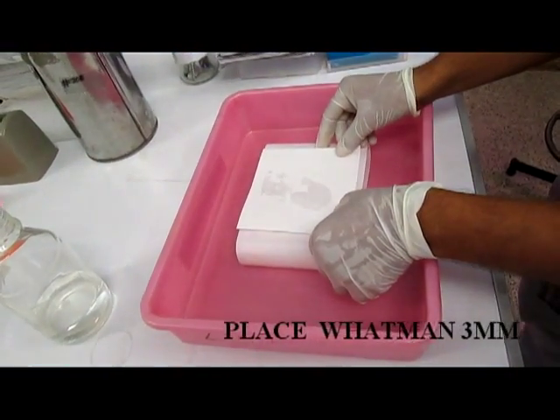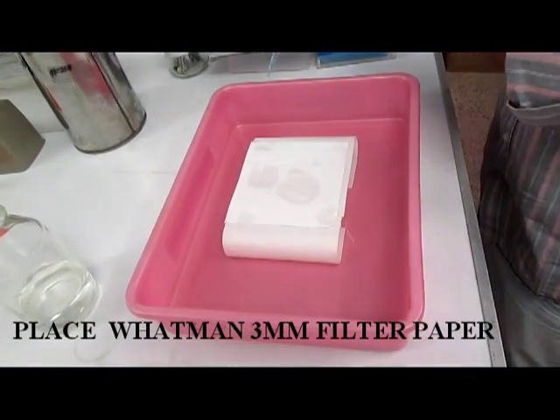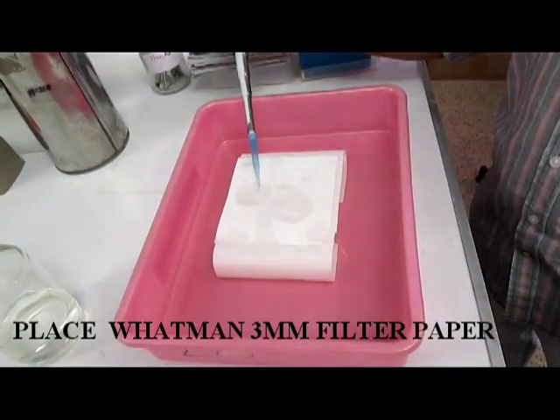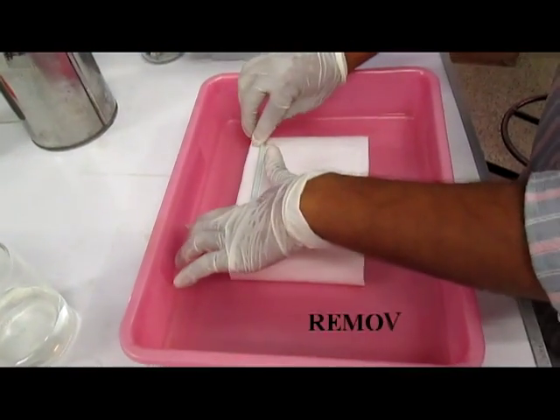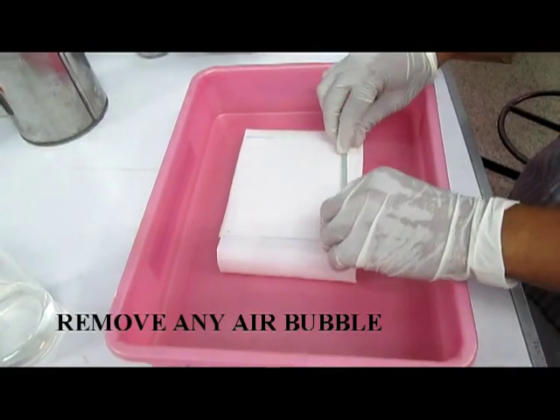Then on the top of the wick Whatman paper, place another Whatman paper with the size of the gel and soak this with the 10x SSC buffer. And then remove any air bubbles present by using a glass rod.